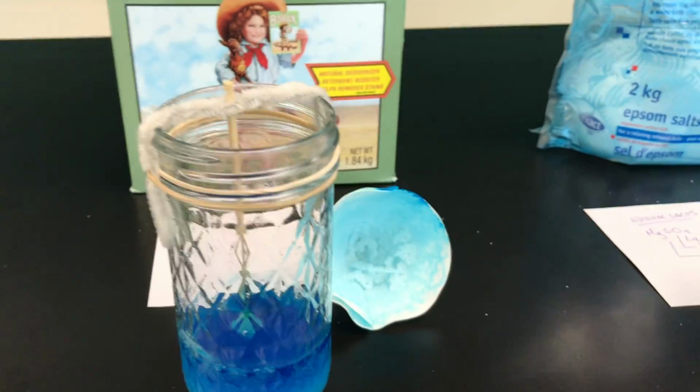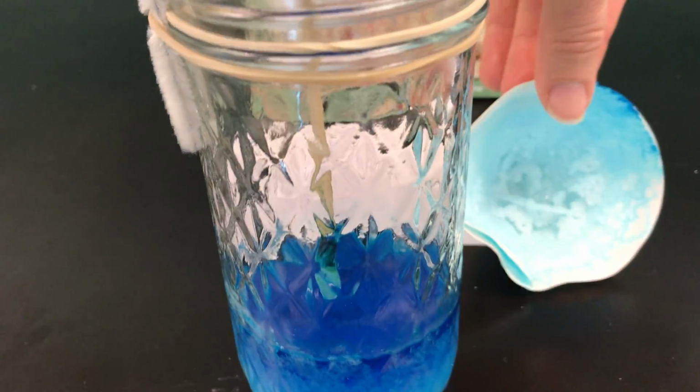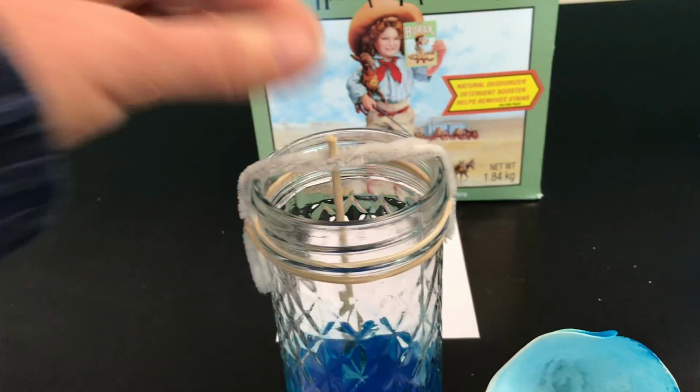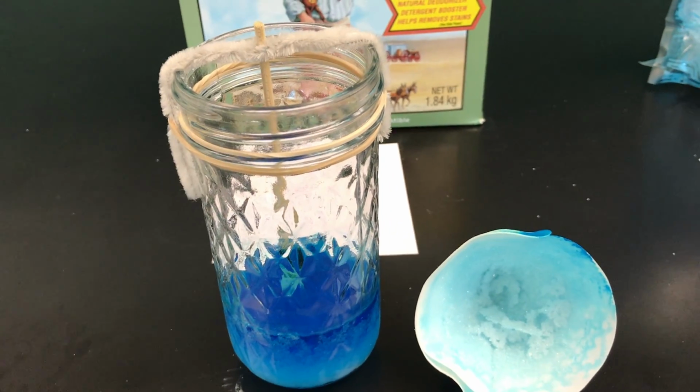The borax pretty much crystallized immediately, actually in the filter paper. It's fully crystallized. In the jar, there are some crystals, mostly on the outside of the jar. Not very much actually precipitated or solidified at that nucleation point, or the stick going in.